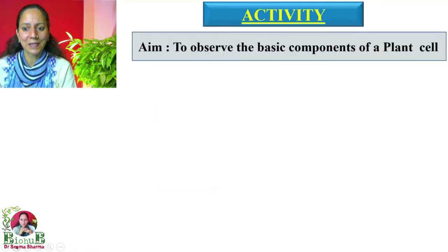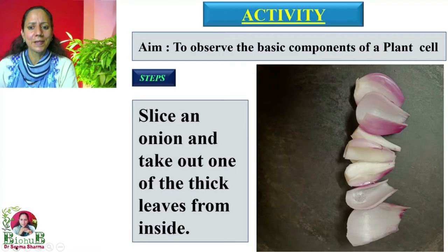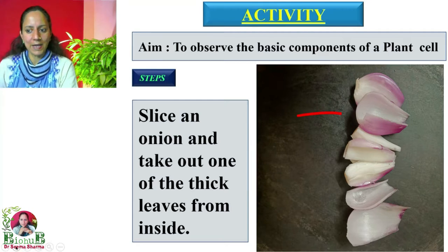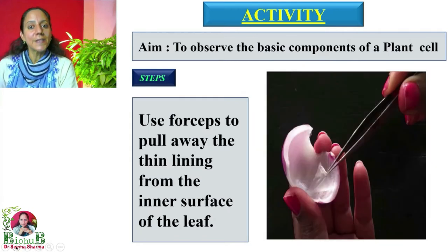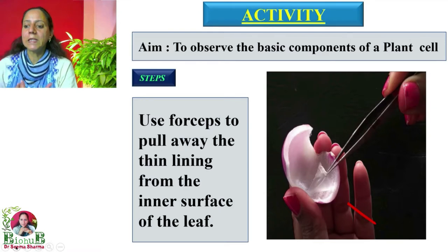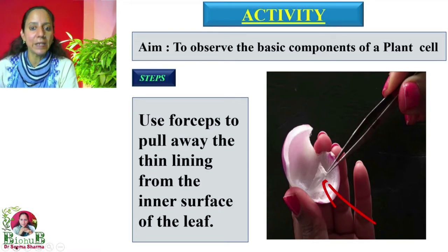Coming to the steps: Step one — slice an onion and take out one of the thick leaves from inside, as shown here. Step two — use forceps to pull away the thin lining from the inner surface of the leaf.